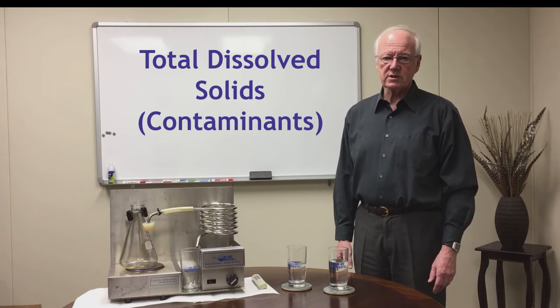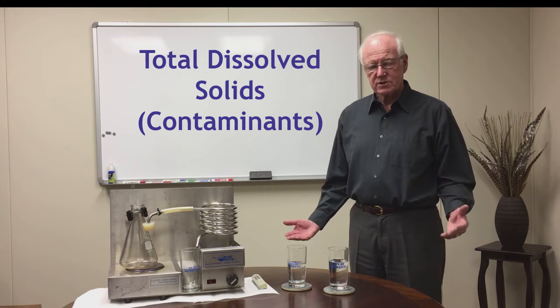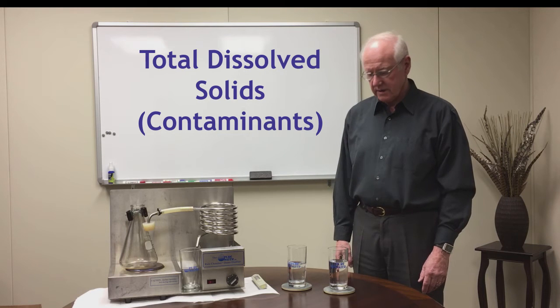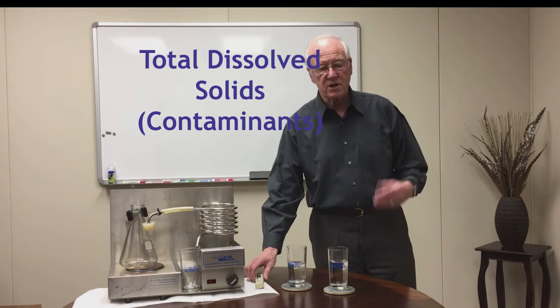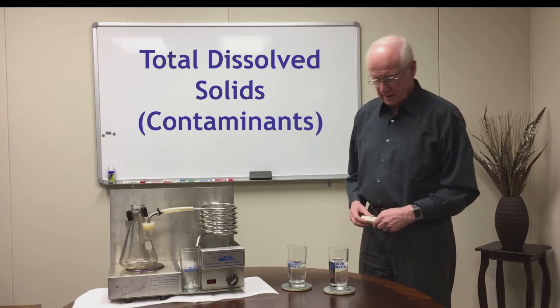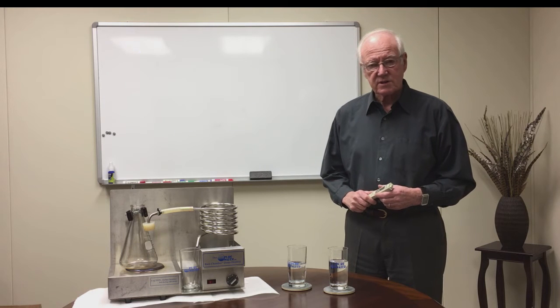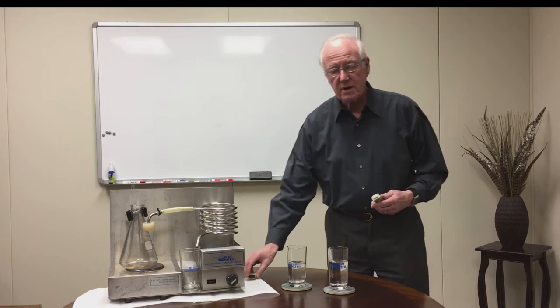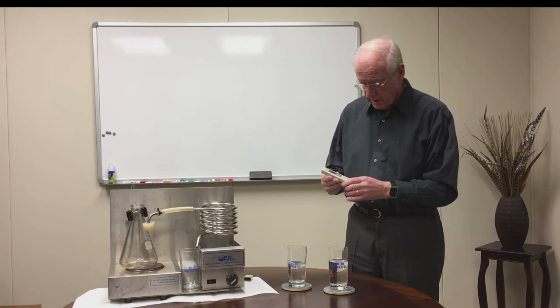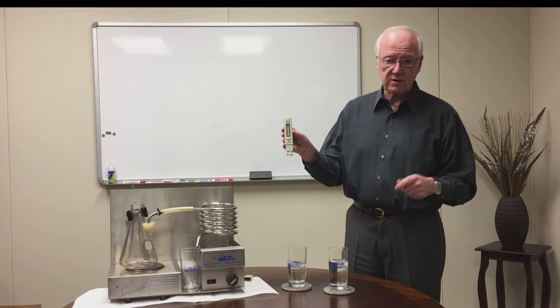The first thing I want to do is show you that two glasses of water that look identical may not in fact be identical. There are certain contaminants in the water that dissolve and conduct electricity, and through that conductance we can measure the amount of those contaminants in the water. I've got here a TDS meter — a total dissolved solids meter.